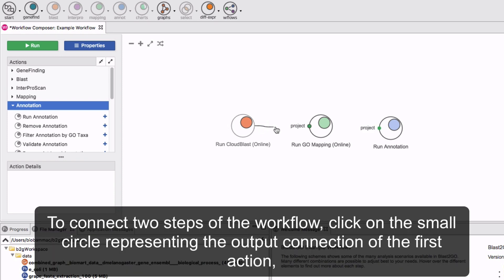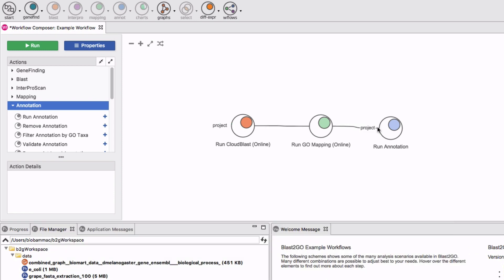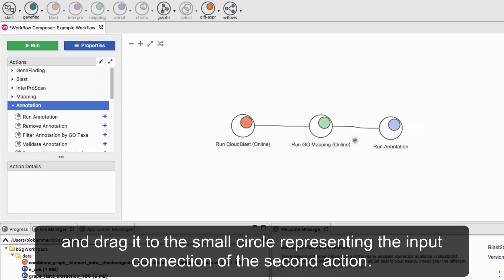To connect two steps of the workflow, click on the small circle representing the output connection of the first action and drag it to the small circle representing the input connection of the second action.